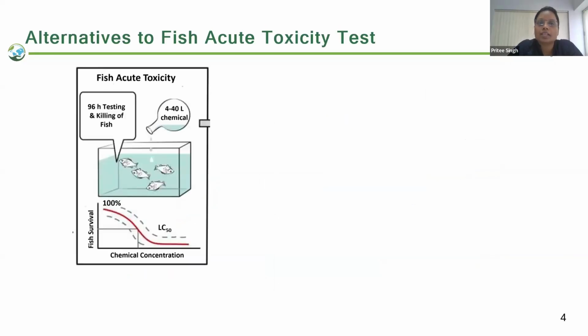So, alternative to fish acute toxicity test. In the traditional fish acute toxicity test, a large number of fish were utilized. For testing at JRF also, we have conducted around 600 to 700 studies. In each phase, these studies are apart from knowing some data about it, as we all know that there are published data available for particular technical chemicals, but for formulated there is no data available.